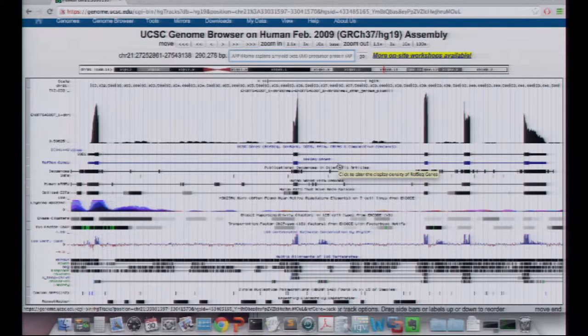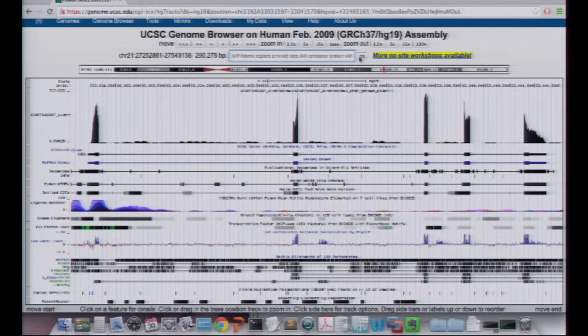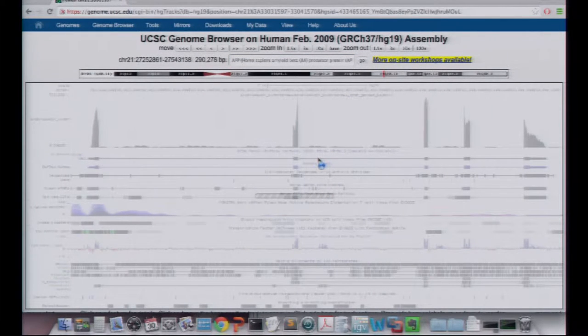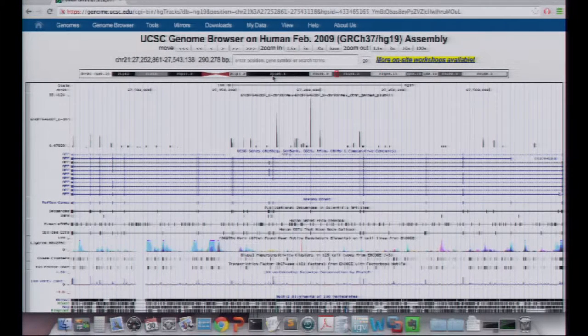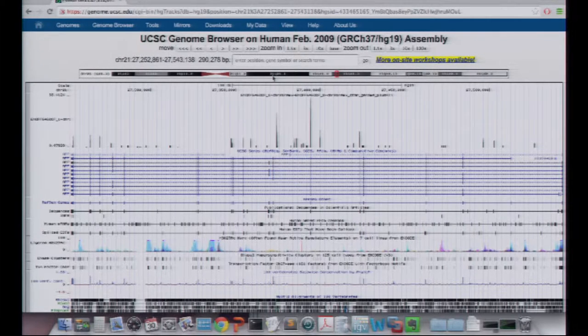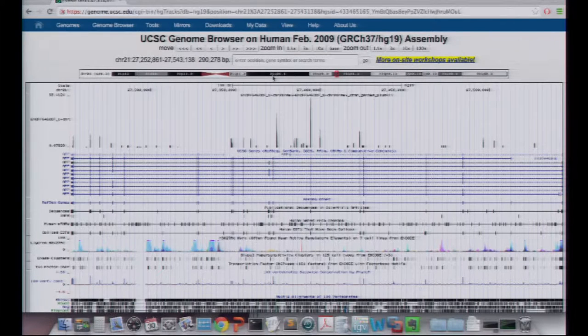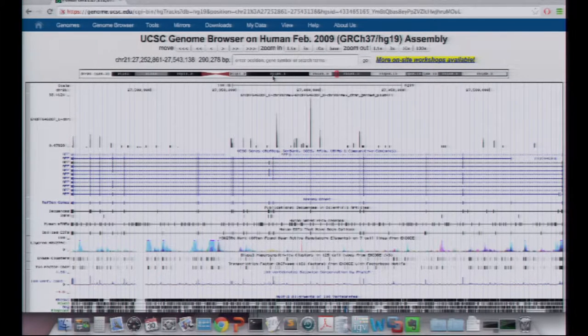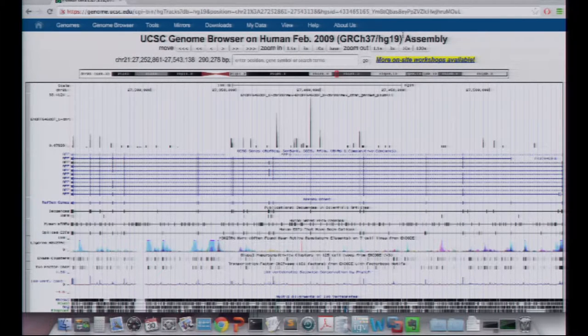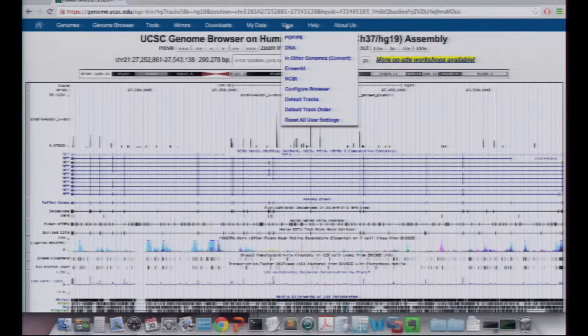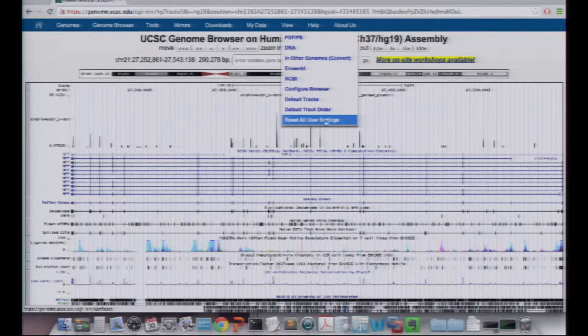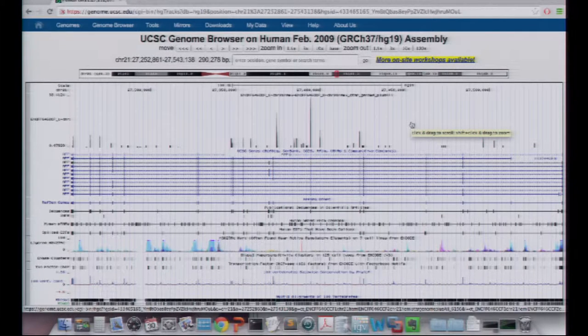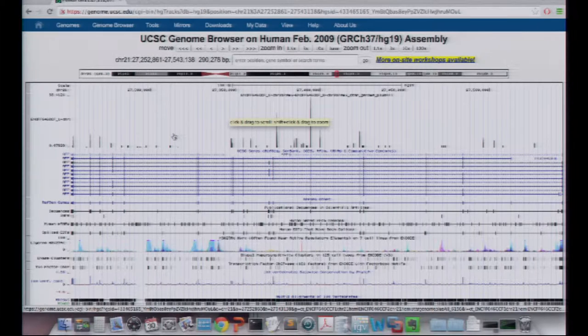Did you have a bigwig file? Did you get a bigwig file, or are you stuck somewhere else? You're on chromosome 11? Oh, well, oh, oh. If you go to your, I should have mentioned this, because I actually forget this all the time. If you go to your own chromosome, your own genome browser, and you use the UCSC genome browser, like regularly, it stores all the information of where you last were, including your last genome reference, including your last position. So you may have to either reset it to HG19, or you can specifically go to View, Reset All User Settings. Obviously, if you want to keep your user settings, you shouldn't reset them. You shouldn't then figure out how to visualize it on this browser.